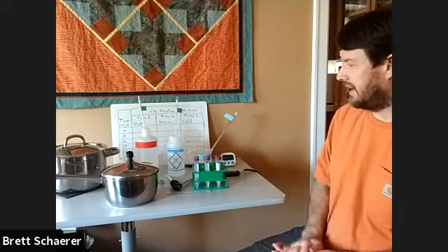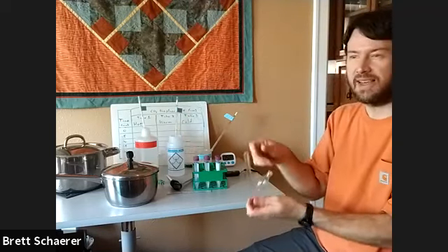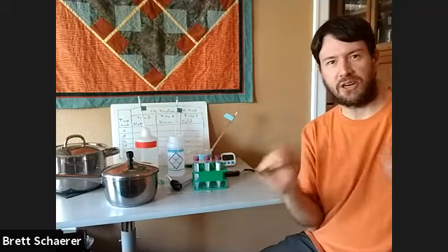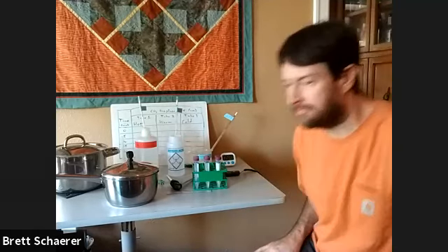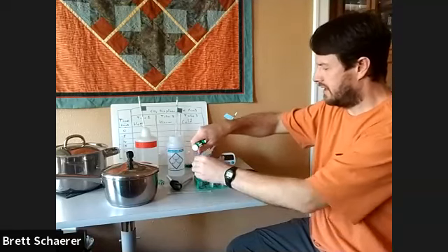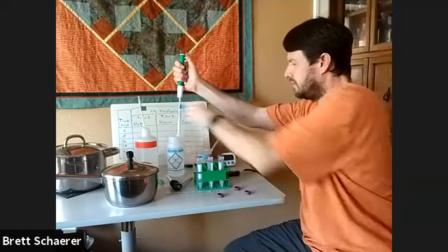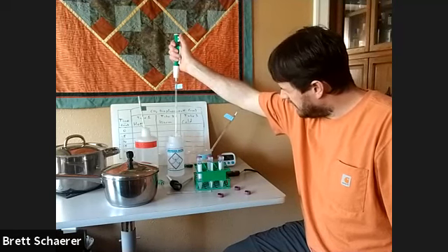And then we'll put them in the fermentation tubes. And I'm also going to put the fermentation tubes into those different temperature environments. So everything will be at the same starting point when we start the fermentation. So we're going to measure out the yeast and water. And for this, I'm going to do 2 milliliters of water in each tube.